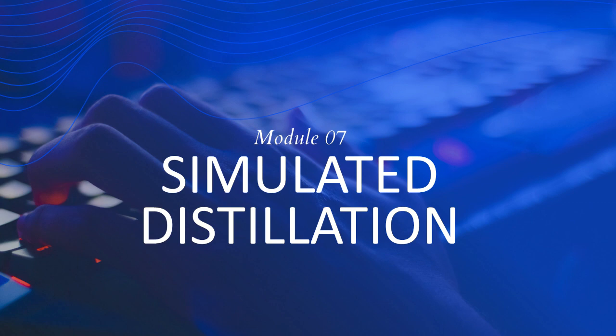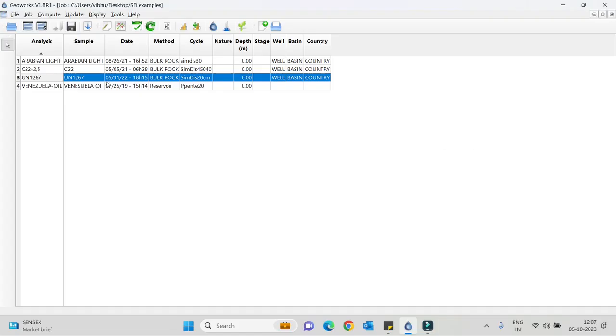It is a simple mathematical method based on Antoine's equation curve to simulate the physical process of distillation. This process models the phase transitions of an alkane hydrocarbon of C1 to C120 at a single heating rate measured in degrees Celsius per minute. This module also provides details about the oil's composition, including parameters such as average molecular weight, initial and final boiling point. In the job management window, we can choose one of the analyses and click on the icon for simulated distillation.